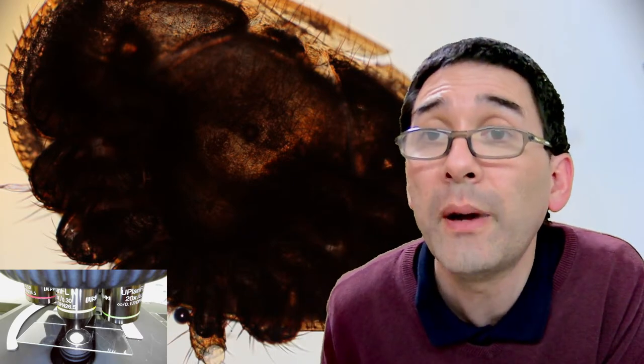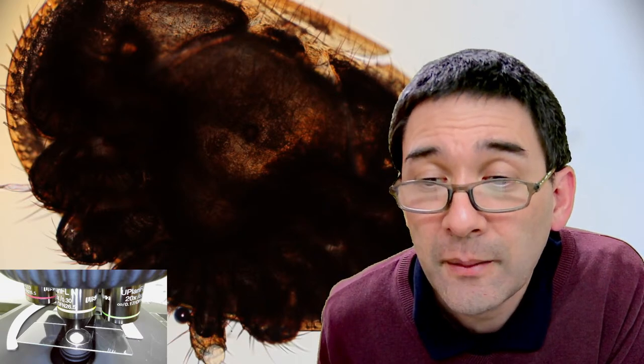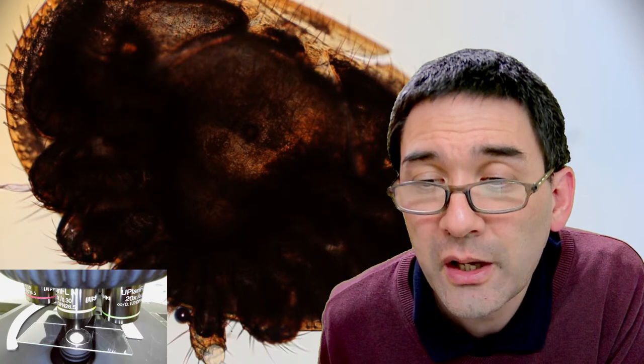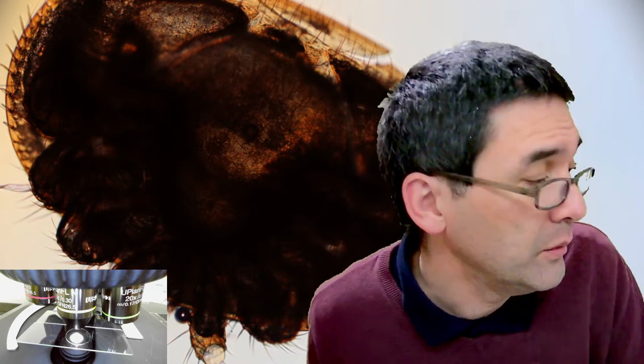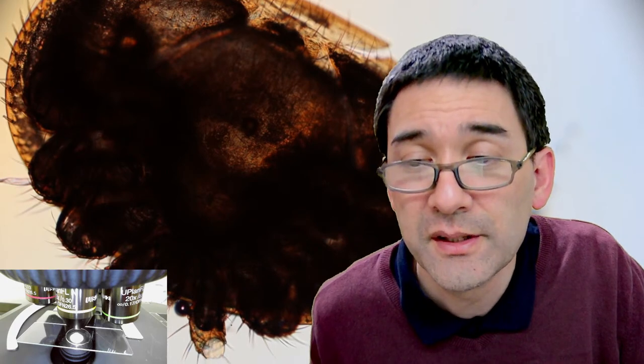So I will go back to some of the questions again. Yeah, are those claws? I don't know exactly. Okay, are you talking about the mite now? Yeah, these are the legs of the mite, if this is the kind of thing.